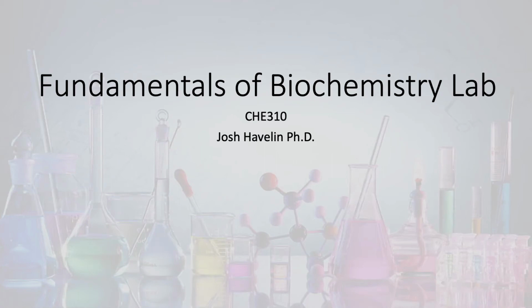This video is meant to supplement some scientific background as well as material background on the process of reverse transcriptase PCR for our Fundamentals of Biochemistry lab. Our first section lets us utilize reverse transcriptase PCR to analyze the expression profiles of desired messenger RNA.